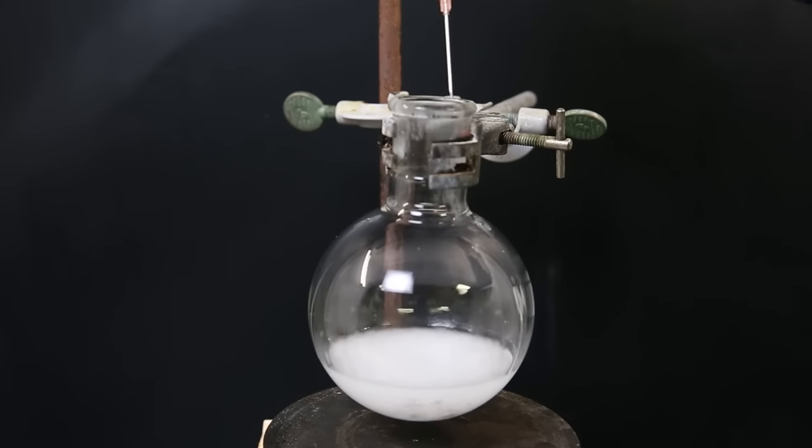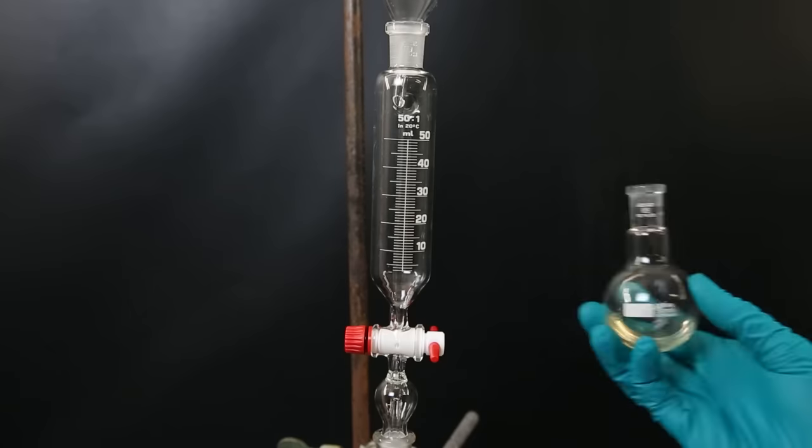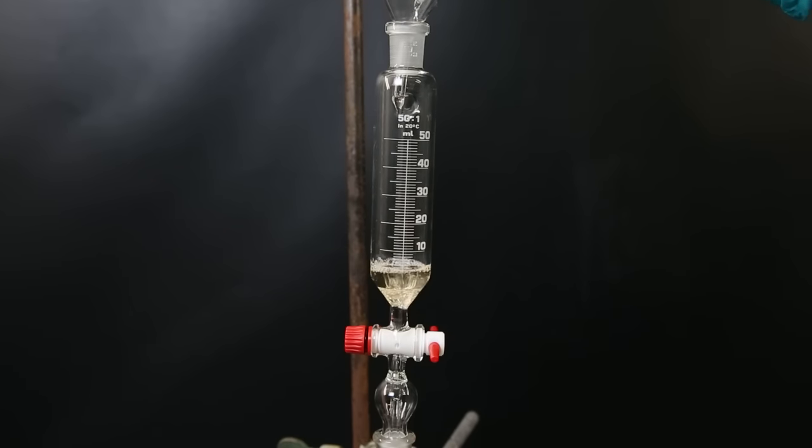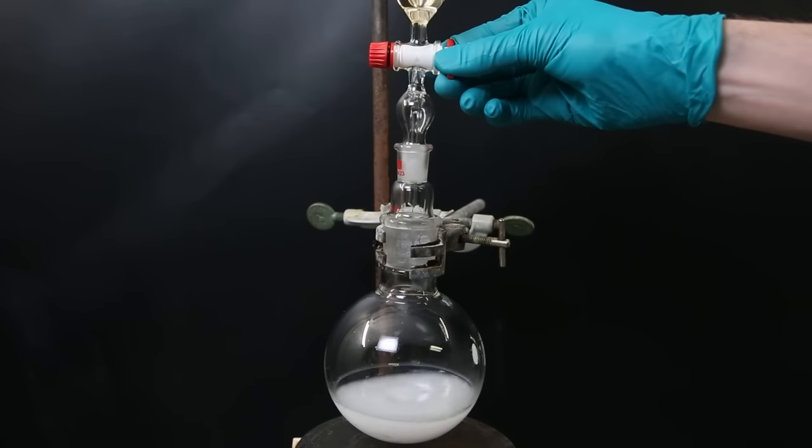I then wash the sides and the neck of the flask with some more ether. Now I attach a dropping funnel and pour in all of the tributyl tin chloride. I then open the dropping funnel and drop-wise add the tributyl tin chloride to the flask.